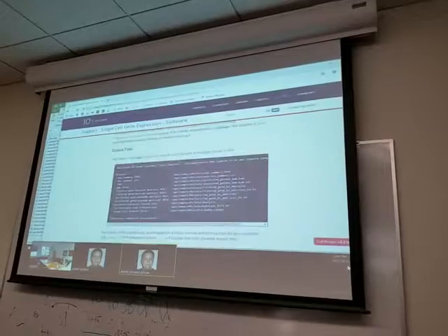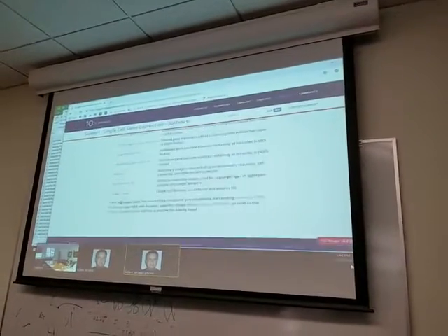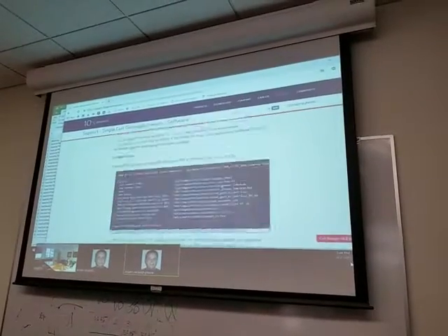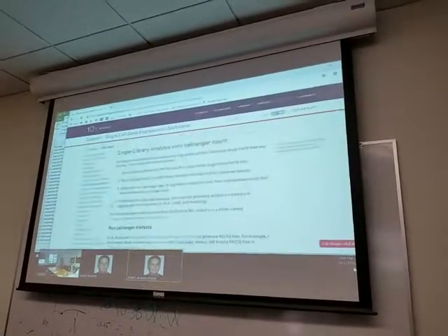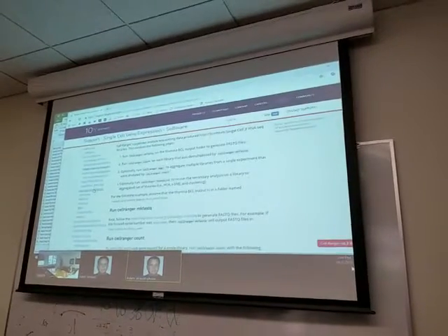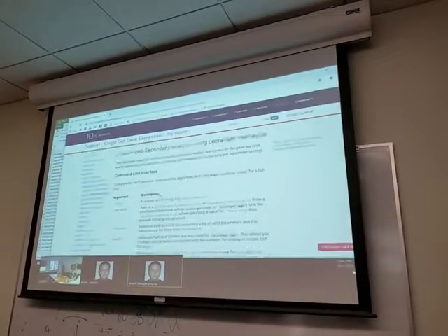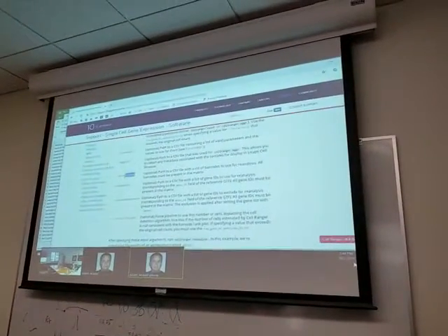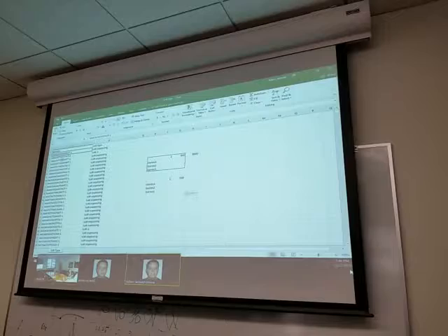It's an optional argument. I guess it's Cell Ranger. Actually, it's probably Cell Ranger reanalyze, so you can repeat the analysis. Oh, customize reanalysis. Yeah. Oh, good. And then you give it this list of barcodes. So that would be basically just this list.